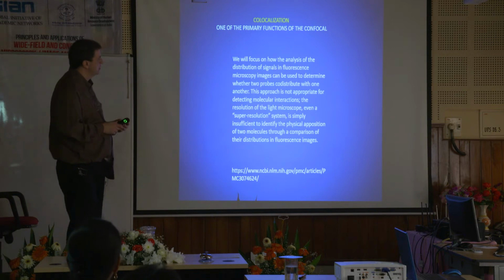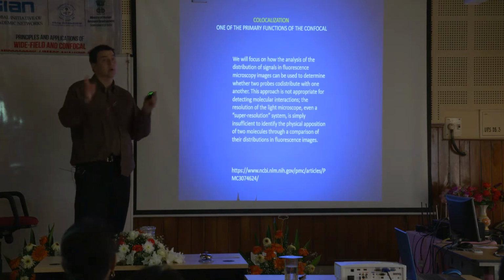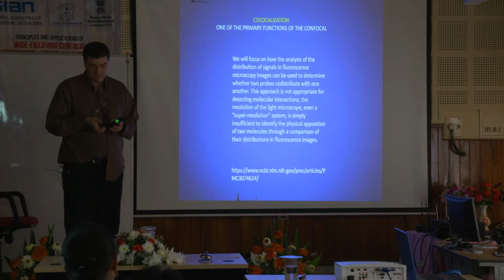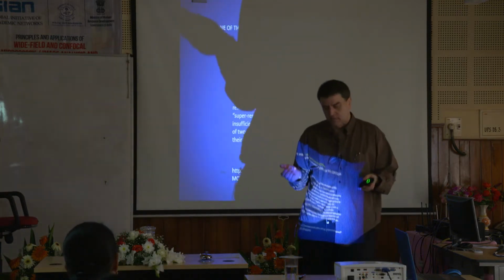Co-localization is a big part of confocal. As soon as you say to me, "Hey, I want to do co-localization," the first thing that snaps in my mind is, okay, well, we're probably going to have to go to confocal. Almost for sure.